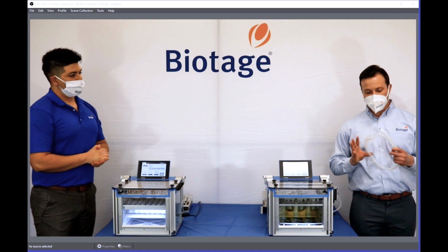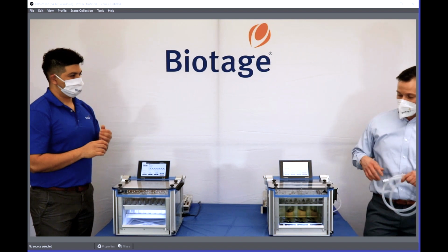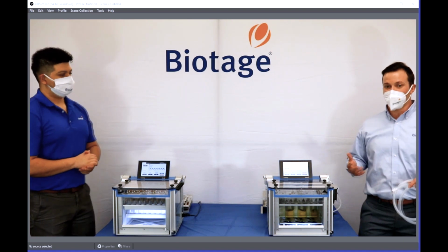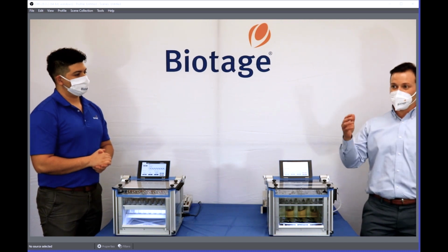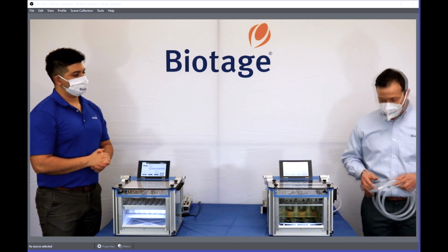Yeah, so I've been to several labs that have TurboVaps and our classic TurboVap systems. And I've noticed that a big frustration of the older model was having to change out the bath water. As you're concentrating, the bath water will actually calcify, and it is good to keep changing it out and replacing it with fresh bath water. Well, the new system is very simple.